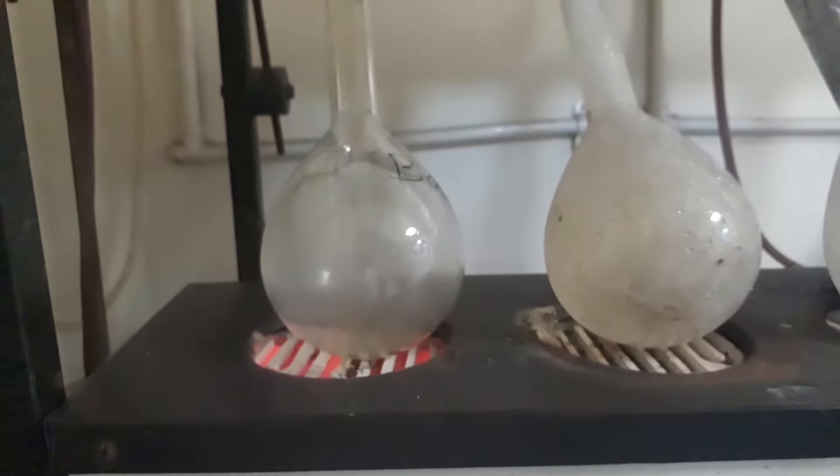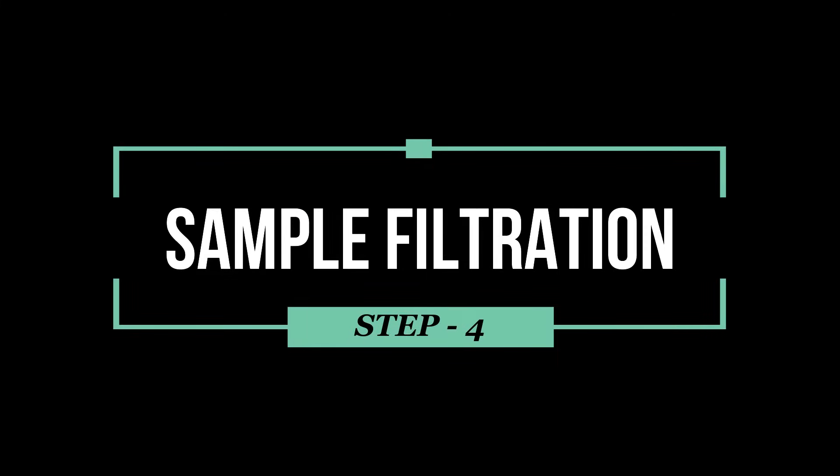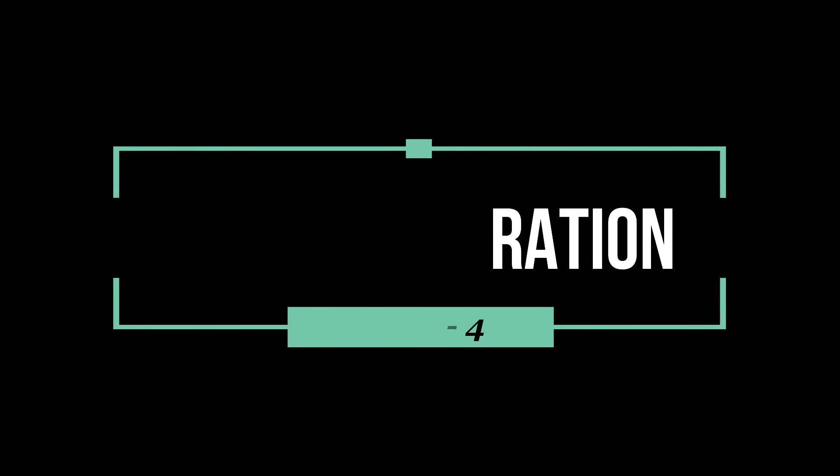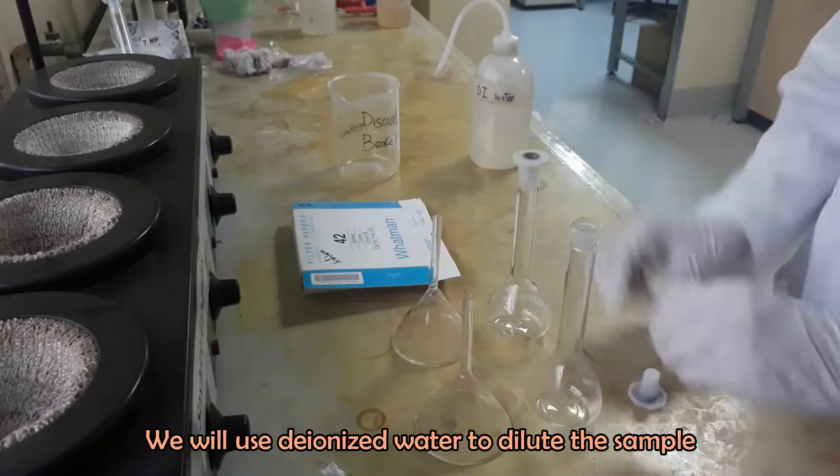Turn off the digestion when 5 to 10 ml of digestive juice is left in the flasks. We will use deionized water to dilute the sample.